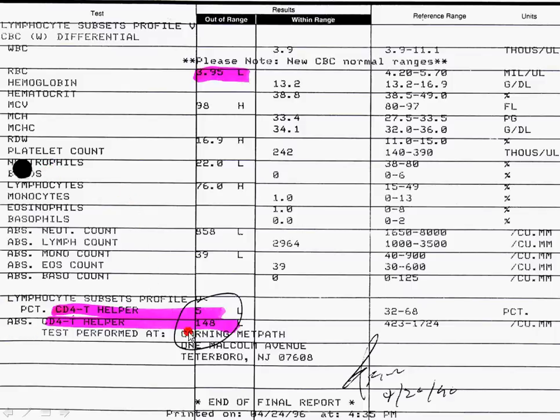The important thing that concerns CD4 cells is down here, the lymphocyte subset profile. This contains two important pieces of information. First, I lost my cursor. Here we go. Percentage CD4 helper and absolute CD4 helper. That's what those are shorthand for. And the results that we have here: percentage CD4 T helper, 5%, and absolute CD4 T helper, 148.